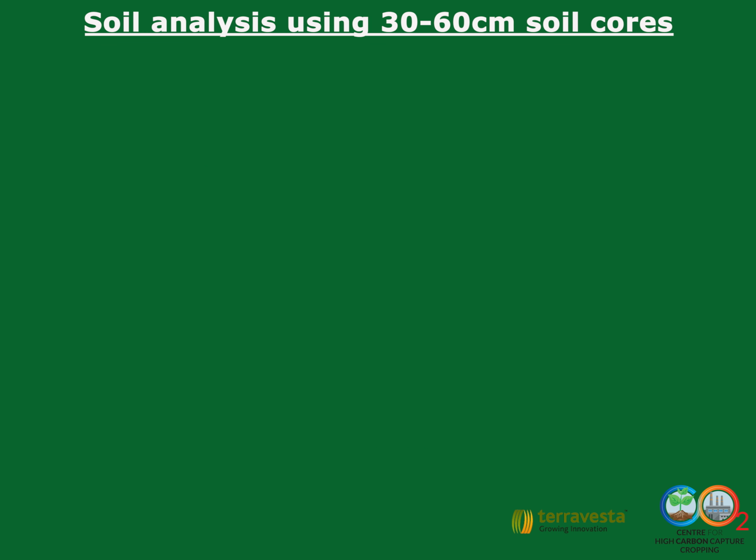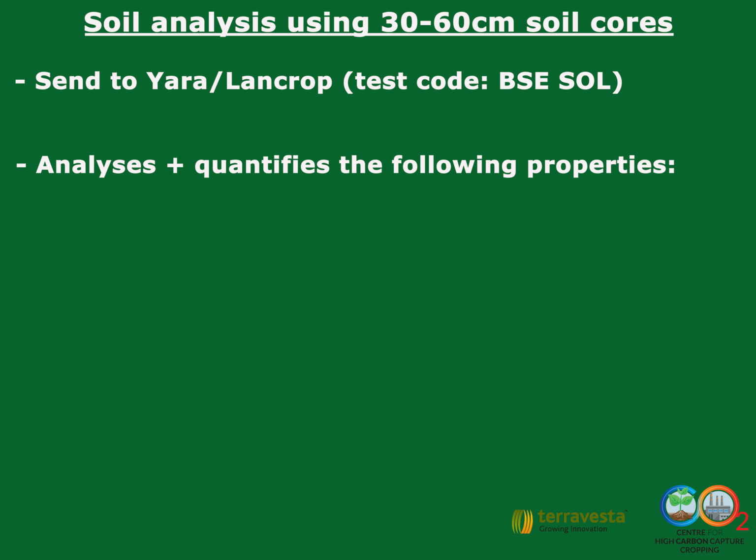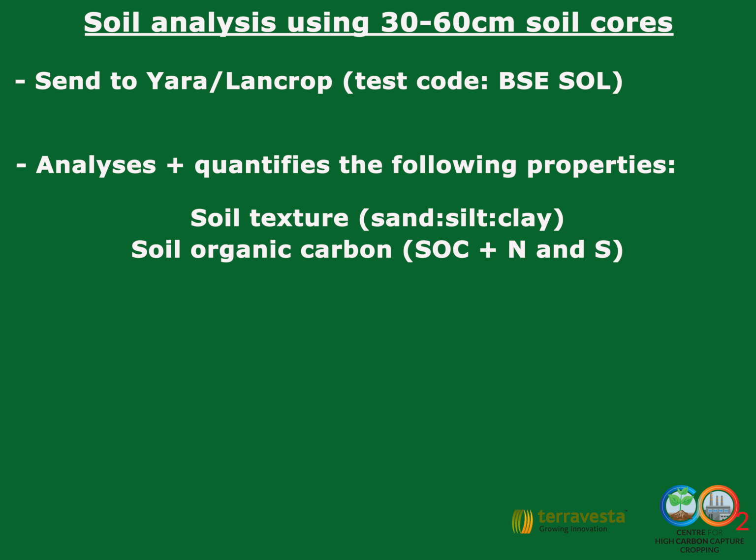Secondly, to conduct further soil analyses using soil taken from deeper depths of 30 to 60 cm for sending to Yara or LandCrop to analyse and quantify the following soil properties: soil texture, soil organic carbon, soil carbon using loss on ignition method, pH, and bulk density.